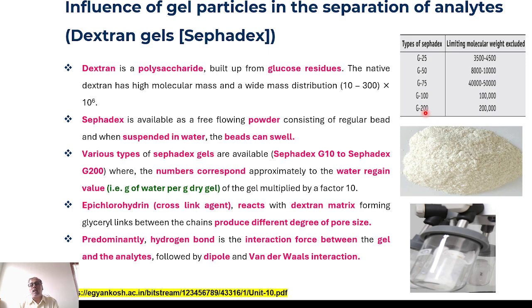That means 1 gram of gel can approximately hold 18 to 20 ml of water. So you can calculate the water content, and you can slightly increase or decrease it, so that you can create a fantastic gel-like architecture. So in Sephadex, the numbers denote the water regain property.